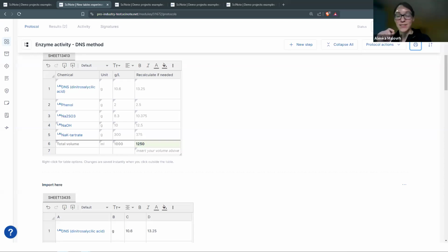That is actually also one of the things that we didn't yet include into the upcoming releases for the tables, but we are considering this for the future. So we do think of introducing an additional option where you could set the number of decimals that you want to see. So as mentioned for the 2 before, we will add this to the list of feedback that we received and include it into the future updates. All right.